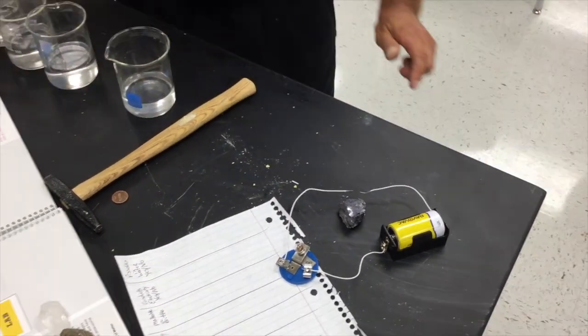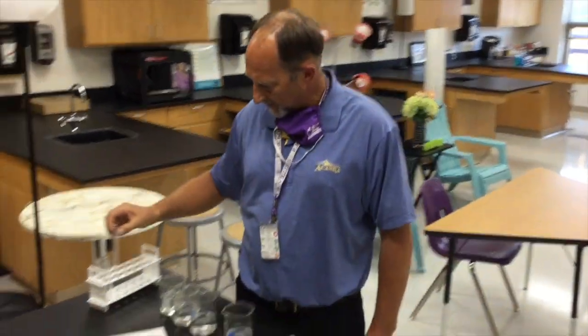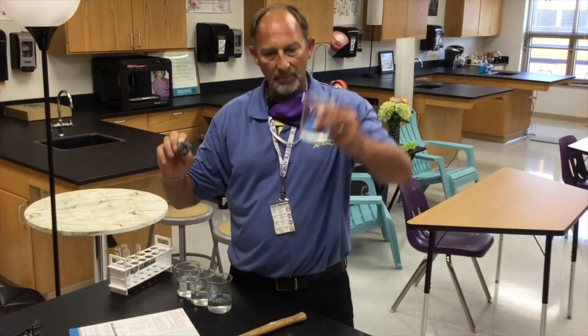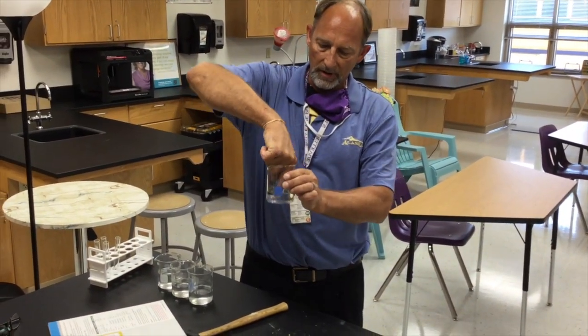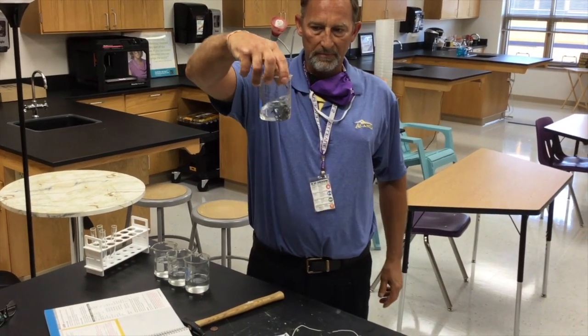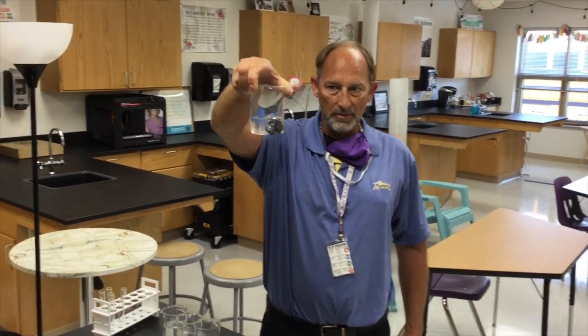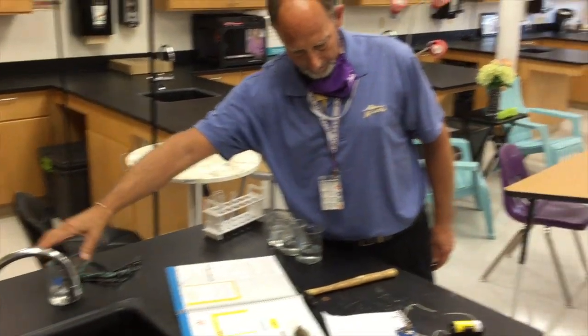And our directions said to dissolve in a test tube. Our specimens are quite too large, so we are going to try to dissolve them in a beaker of water. And I'm pretty sure you all realize what's going to happen. Stir that around and no dissolve. So there's our first compound, all right?